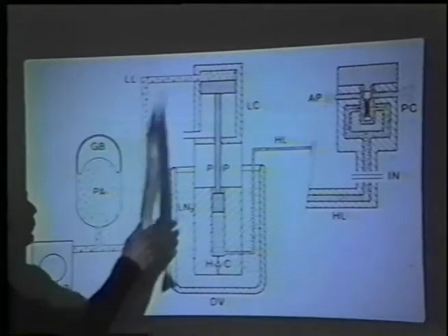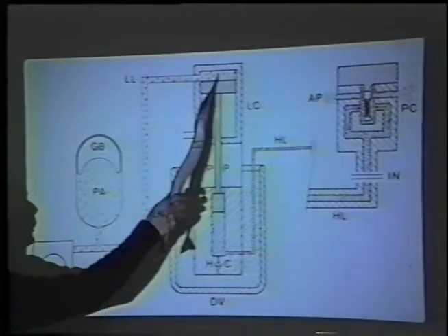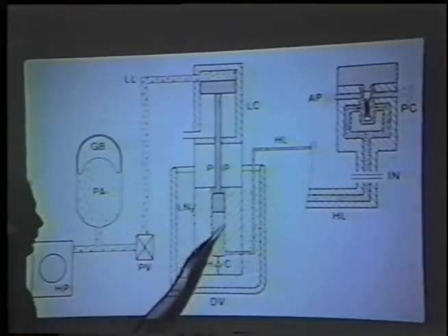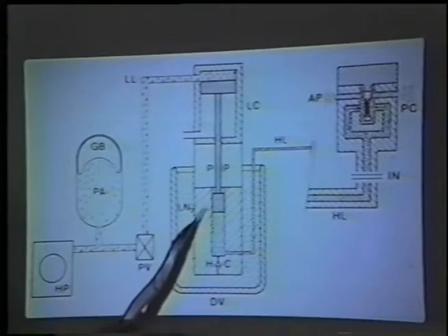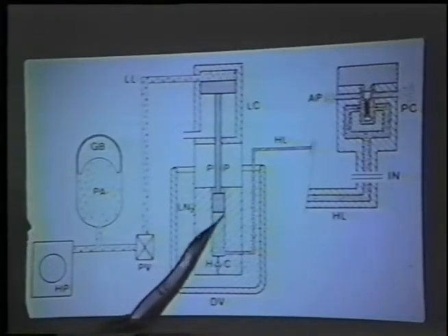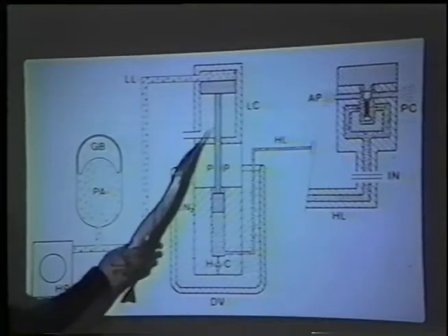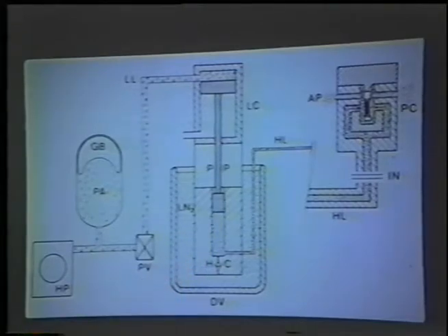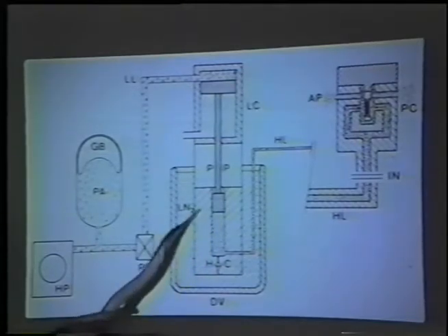When it comes time to freeze, you pressurize this side. This side is at 350 atmospheres. This has a larger surface area than this side, so this side is at a higher pressure. The force on both sides is the same, because the surface area here is smaller. The pressure on this side of the system is larger. The pressure is increased to 2,045 atmospheres in this bottom cylinder.